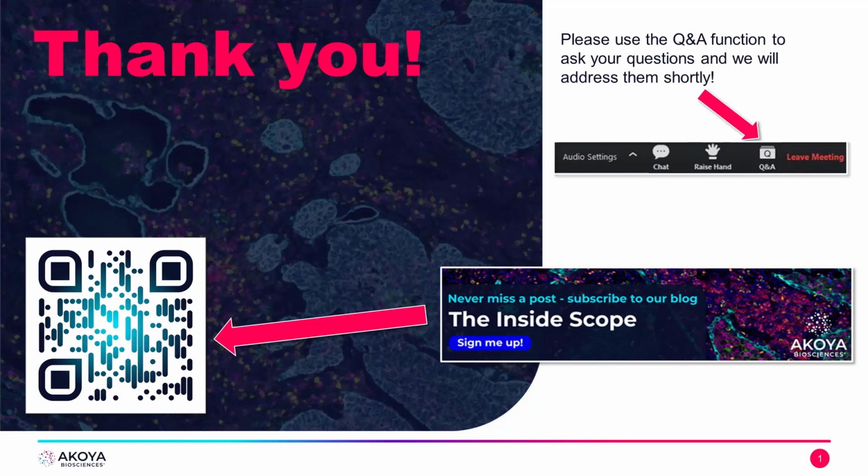Is the microfluidics exchange to the microscope manually done? So no, that's one of the key components of the Codex system. While your staining process is the only manual portion, where you'll be staining your tissue at the wet bench in the laboratory, everything after that is done using the automated fluidics platform.